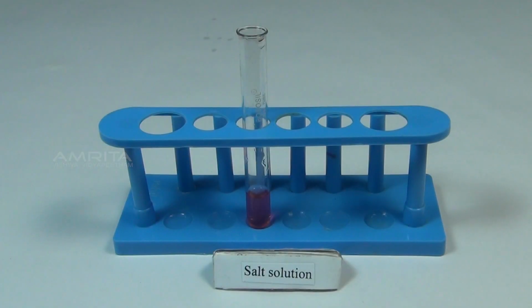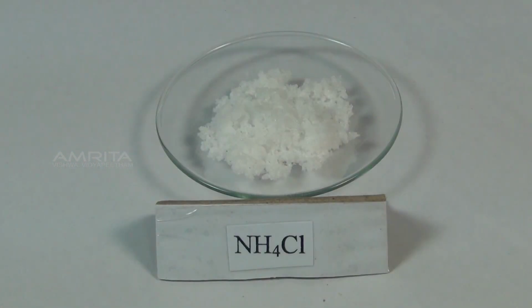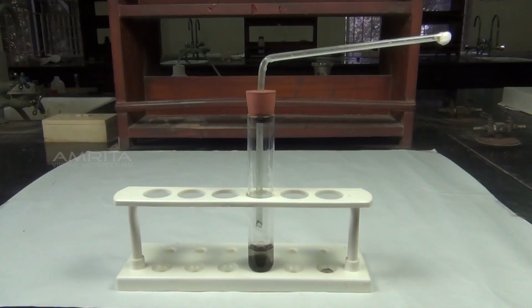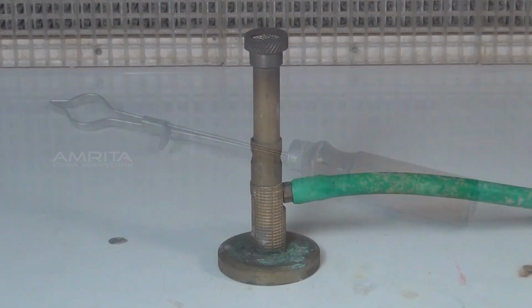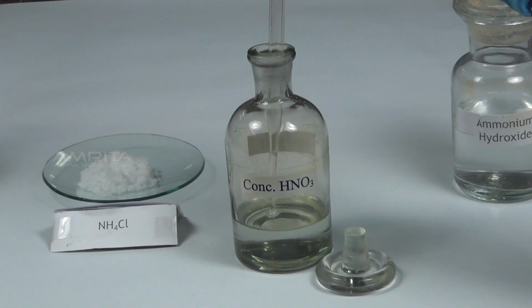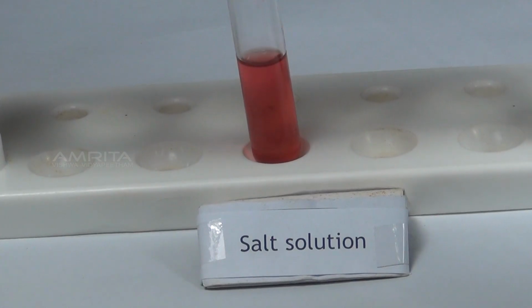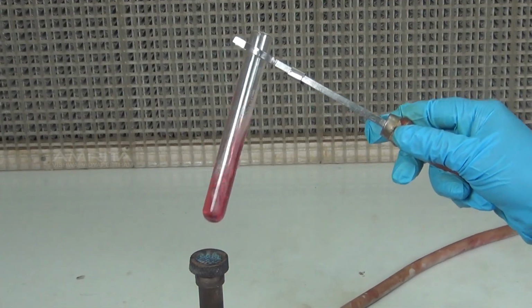Materials required: salt solution in a test tube, concentrated nitric acid, ammonium chloride, ammonium hydroxide, hydrogen sulphide gas, spatula, droppers, test tube holder and Bunsen burner. Procedure: take a small quantity of concentrated nitric acid using a dropper. Add it into the salt solution taken in a test tube. Boil the solution for some time over the Bunsen burner.